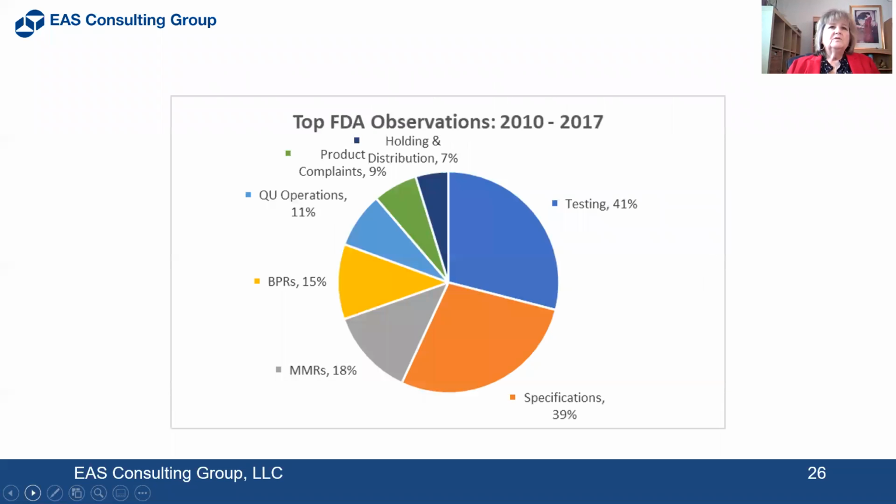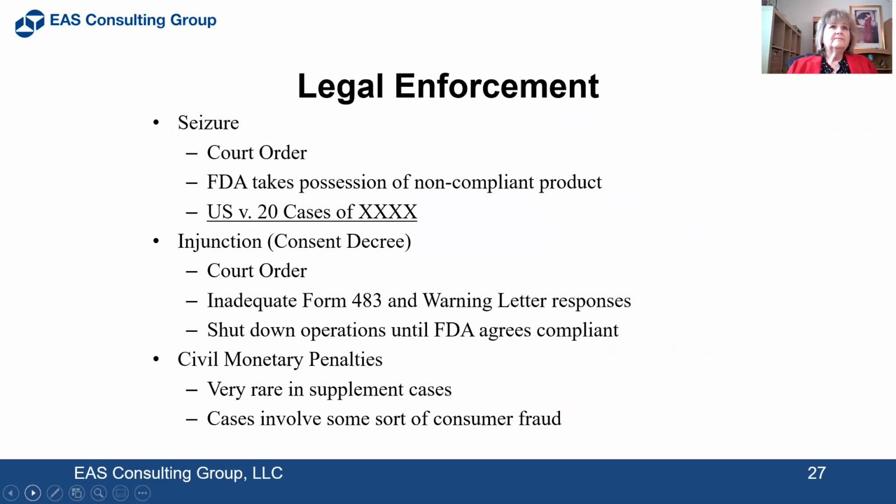A nice visual of that in a pie chart shows you just how much the laboratory and testing is involved in all these warning letters. So it's very important.